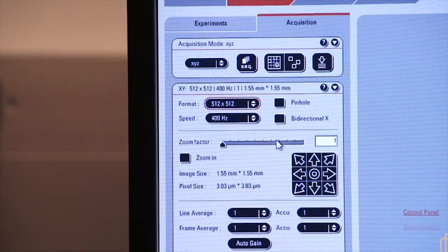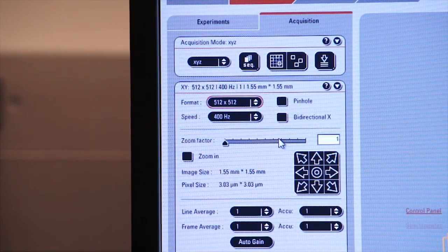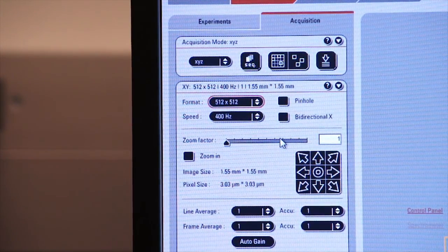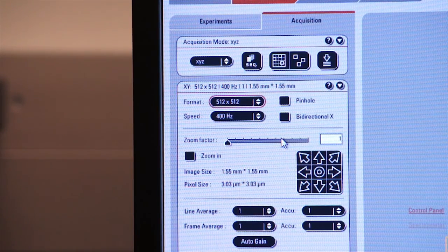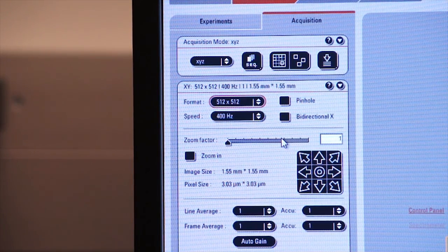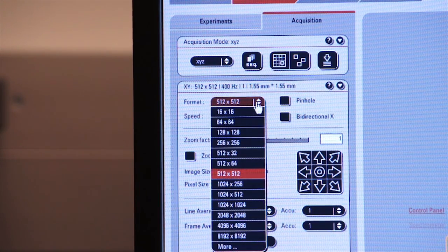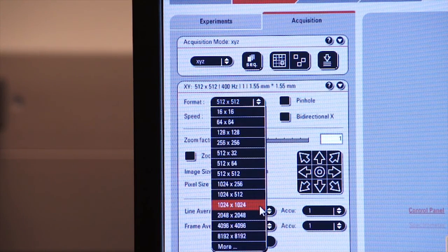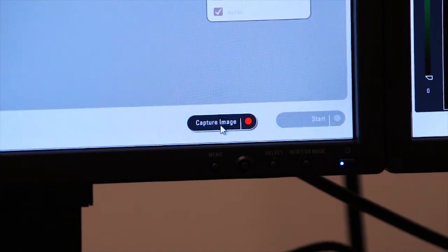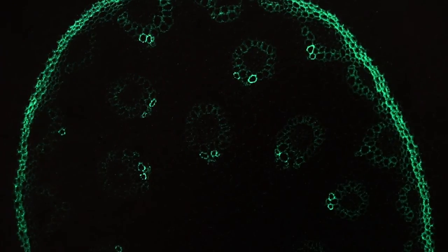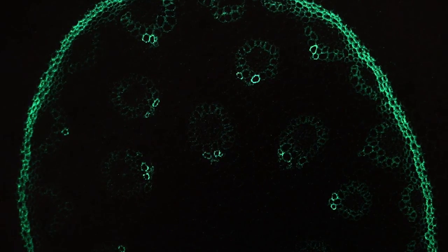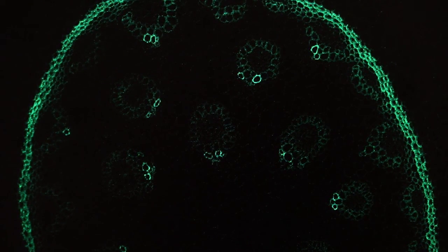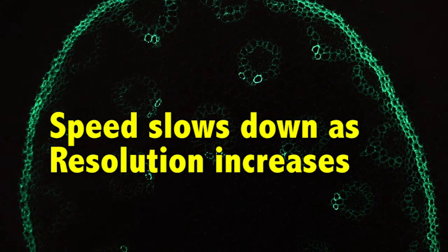Up till now, we've been capturing images at a digitizer resolution of 512 pixels across by 512 pixels down. Let's increase our resolution and give us a better image. So we'll select from the pull down menu a resolution of 1024 by 1024. If I click on capture image, you'll see my image collected on the right screen, a little bit higher resolution than before. And bear in mind that the speed slows down as my resolution increases.